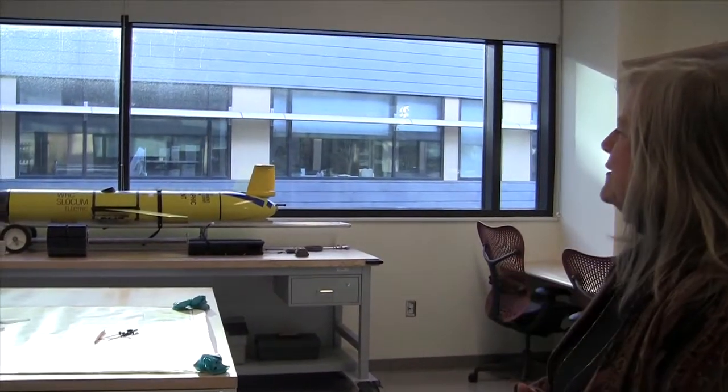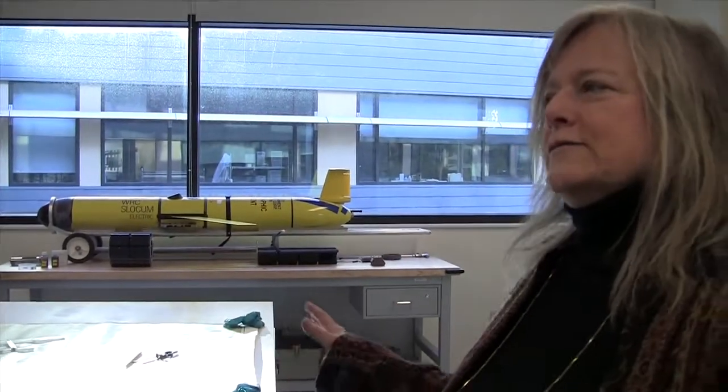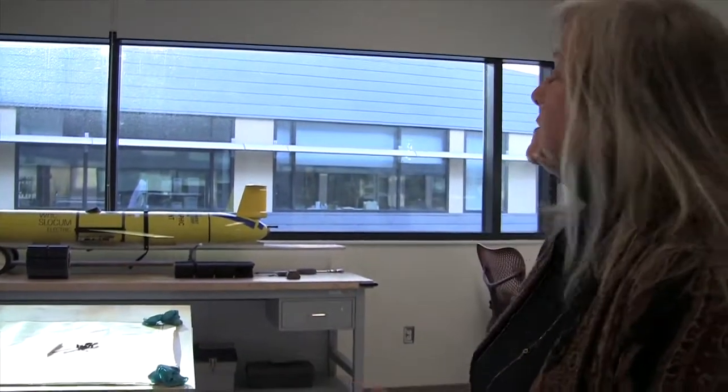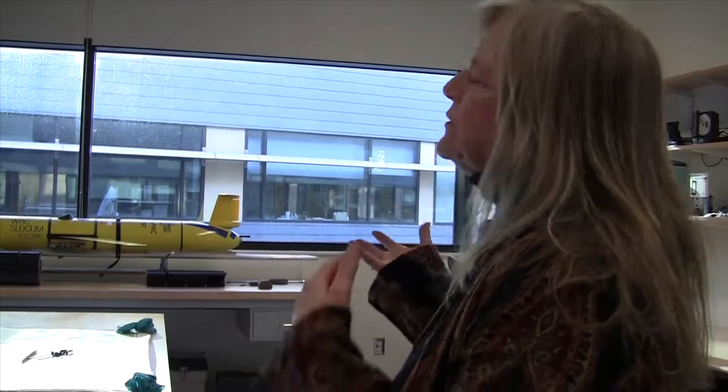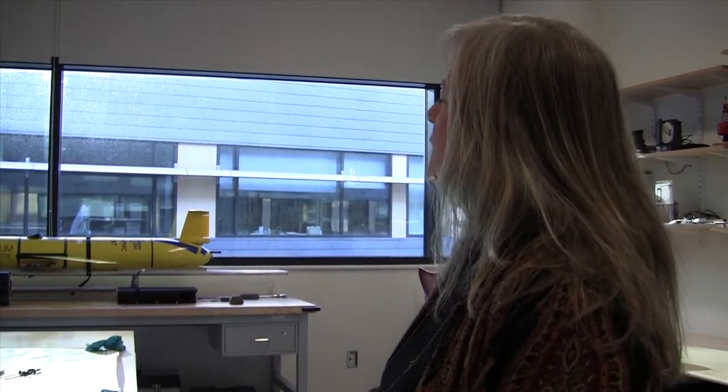Henry is named for Henry Bigelow, and it is part of our ability to go long distances, in this case from Portland to Nova Scotia by itself, and take measurements of a number of things in the water: the salinity, the amount of chlorophyll, in other words how much phytoplankton productivity there is, and temperature, that sort of thing. It has been part of a system that Barney Balch, our senior scientist at this lab, has been running across the Gulf of Maine for now, I think it's in its 13th year, to measure the changing conditions in the Gulf.